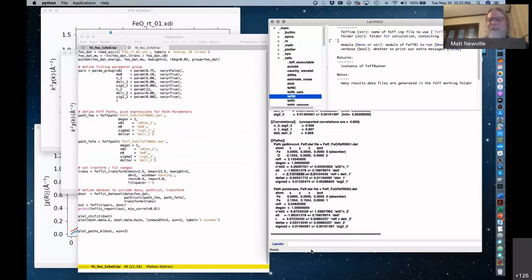We don't have that implemented yet, and that would help eliminate this problem. If the path distance gets too big, you might want to redo those potential calculations. And maybe it would help a little bit and not a lot, but we could in principle do that.